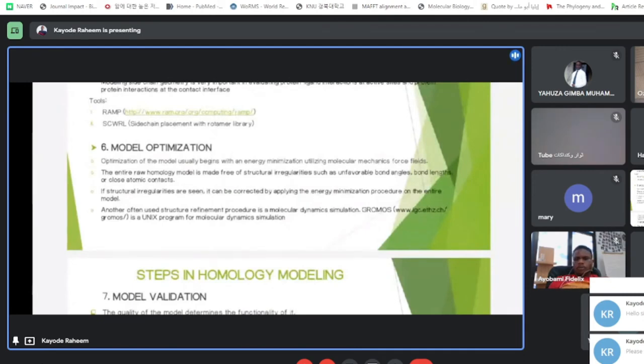I told you we have a lot of servers you can use to do this modeling. That's why I listed out the best. Why are these the best? Because they save us all the stress of doing this ourselves. If you use some other servers, they will just do the modeling for you. They will not correct all these things I'm trying to highlight for you automatically. If you know how, it's fine to continue, but it is time consuming. In our research, we're trying to make everything easy for humans to do. That's why these servers are being used.